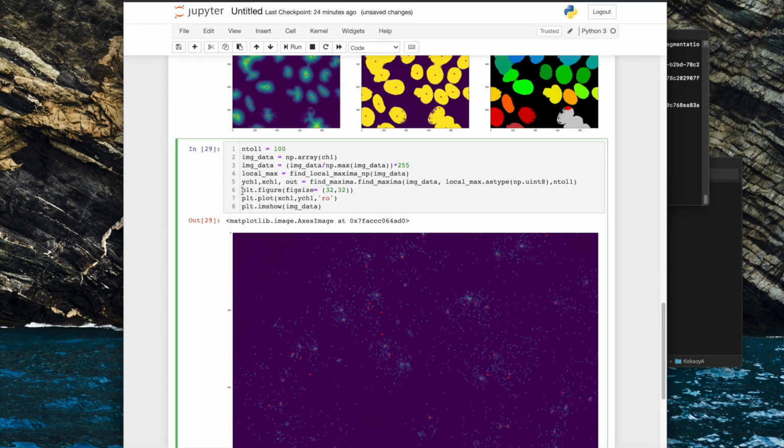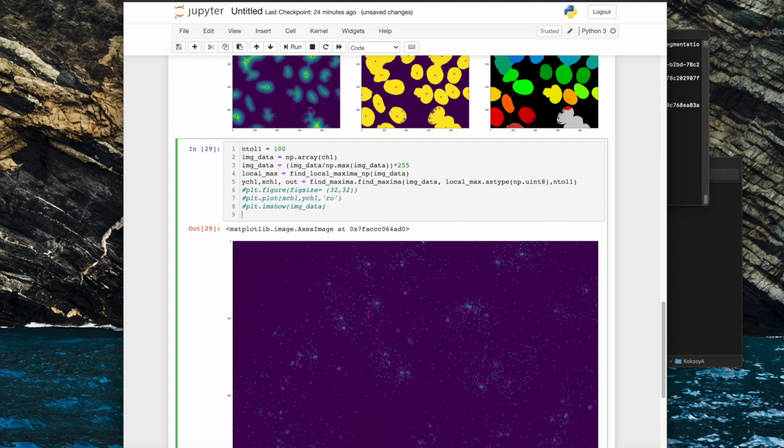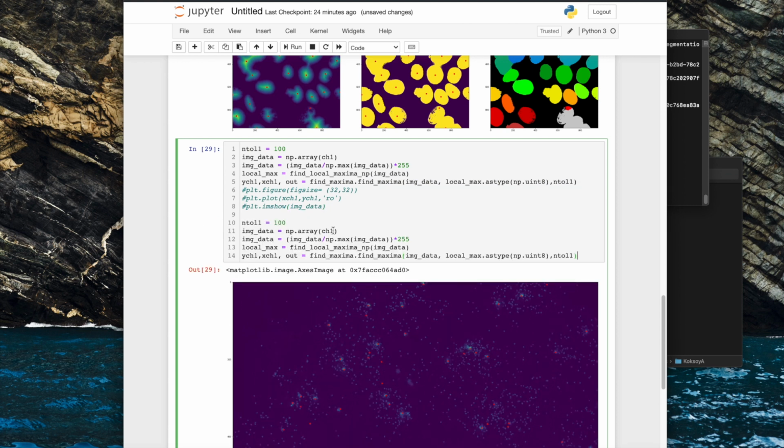And what I'll then do is I'll do it for the second image. So we can just copy this, or the last channel even, rather than the second image. So we're going to go with channel 2, and then just change these. These are the bits I need afterwards. And we can have a little look at this image as well.